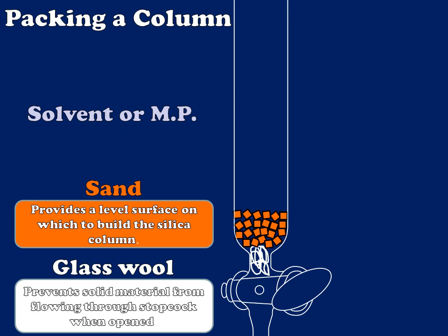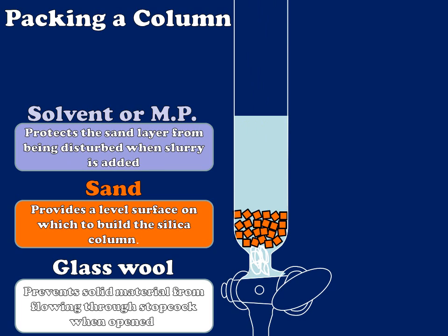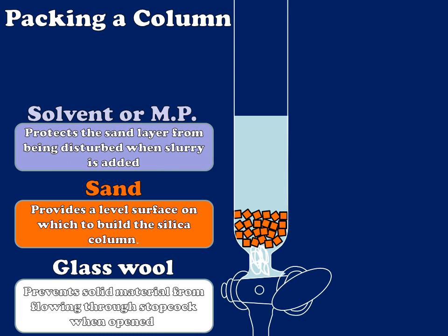Next, I'm going to add a little bit of solvent or mobile phase to the column. The reason I'm going to do this is to protect that sand layer from being disturbed when I pour a very dense slurry of my stationary phase in. So I'll gently add some solvent and then tap my column if necessary to get that sand level again. When I pour my mobile phase slurry in, it will splash into the top of the solvent and not the top of my sand layer.